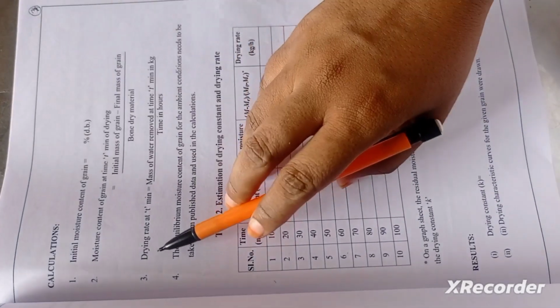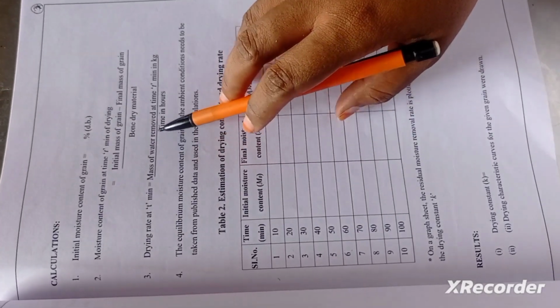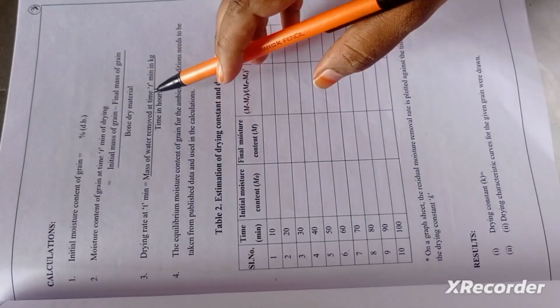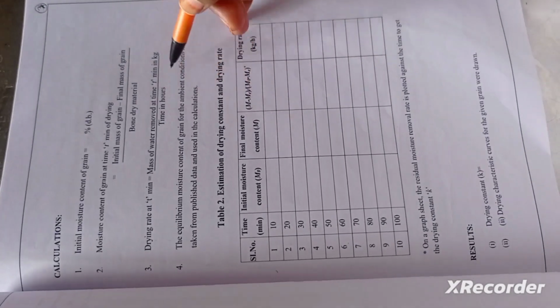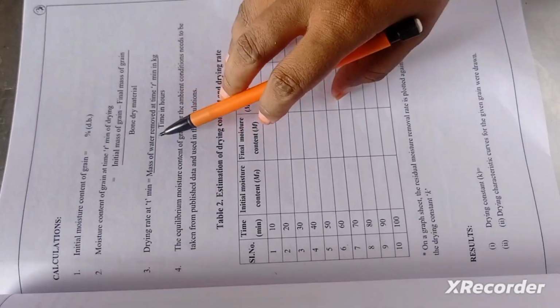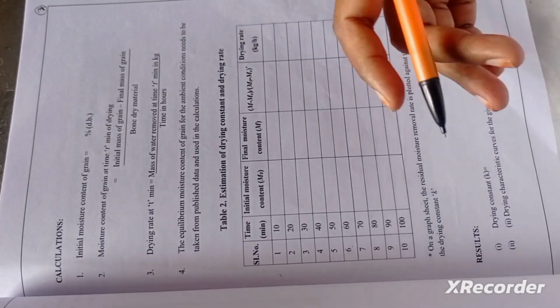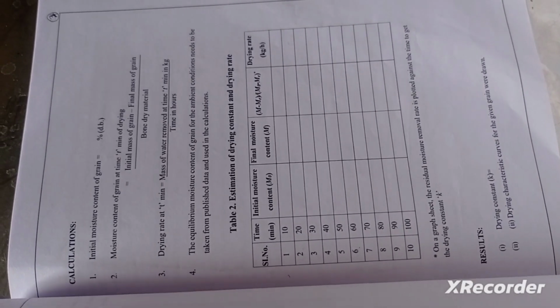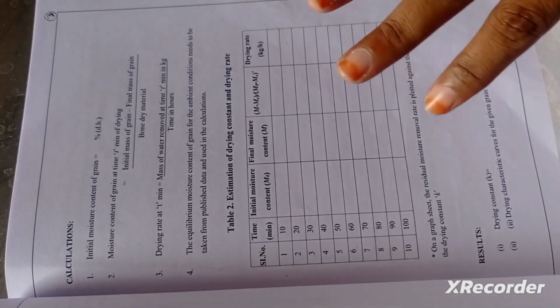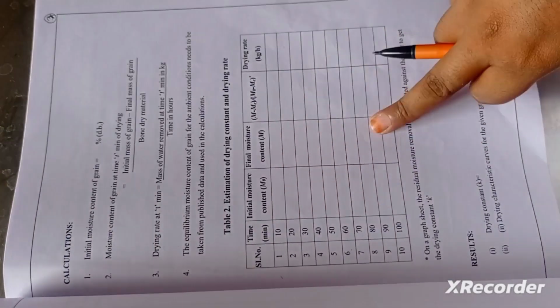Next, drying rate. For drying rate, the formula is mass of the water removed, that is moisture content removed at the time, in kg, divided by time in hours. As we have a digital moisture meter, once we take the sample out, we have to check the weight and moisture content of the taken sample. That we can note down here.